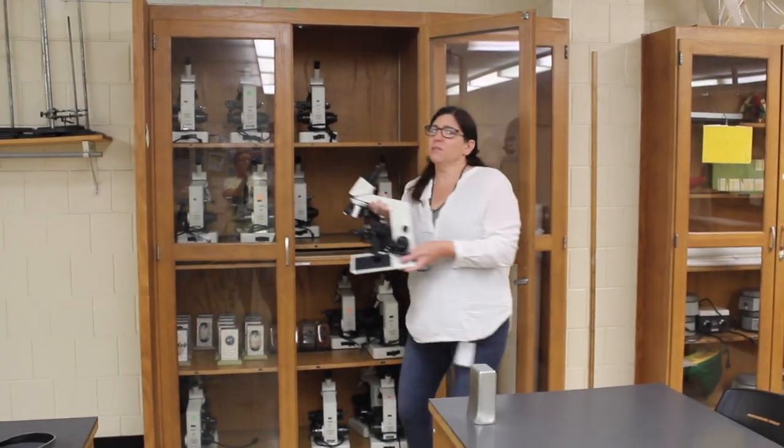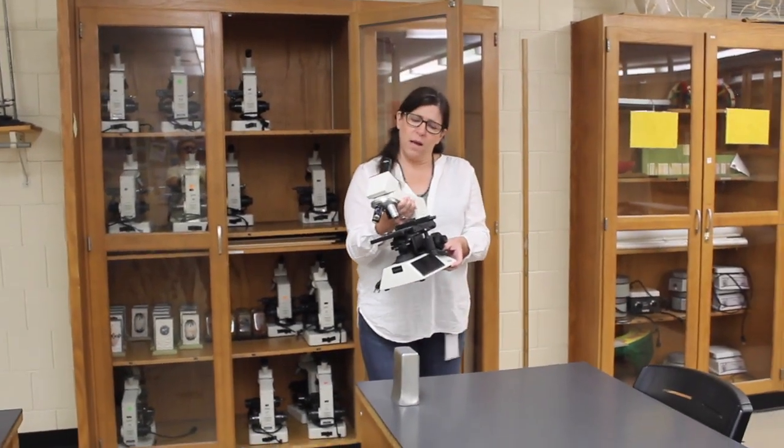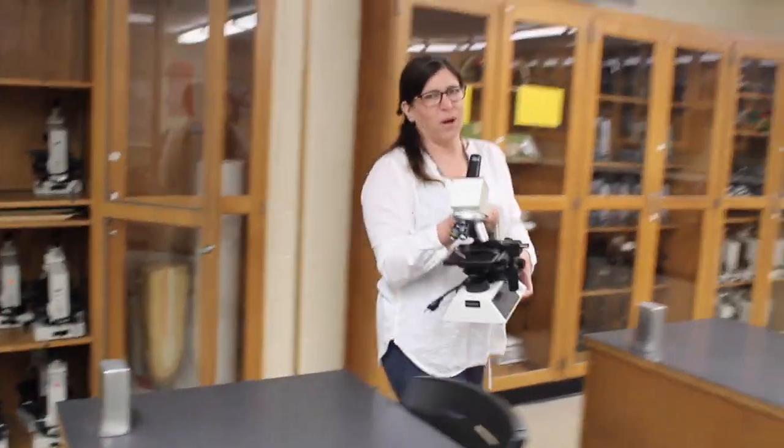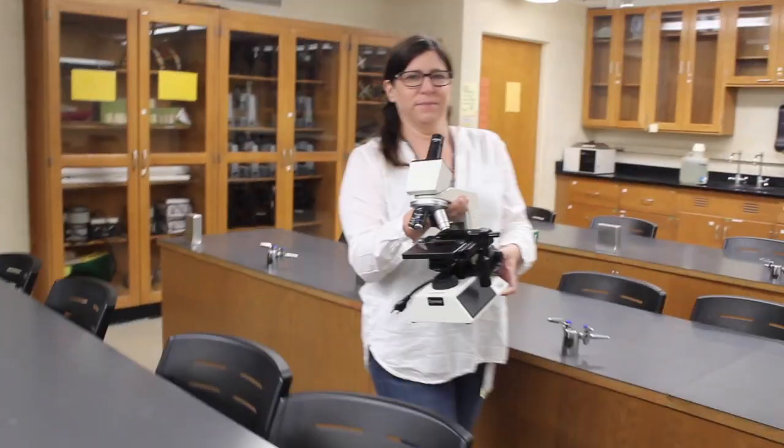The microscope cabinets will be open. Carry it with both hands, one on the neck and one at the base. And then very carefully walk it over to your station.